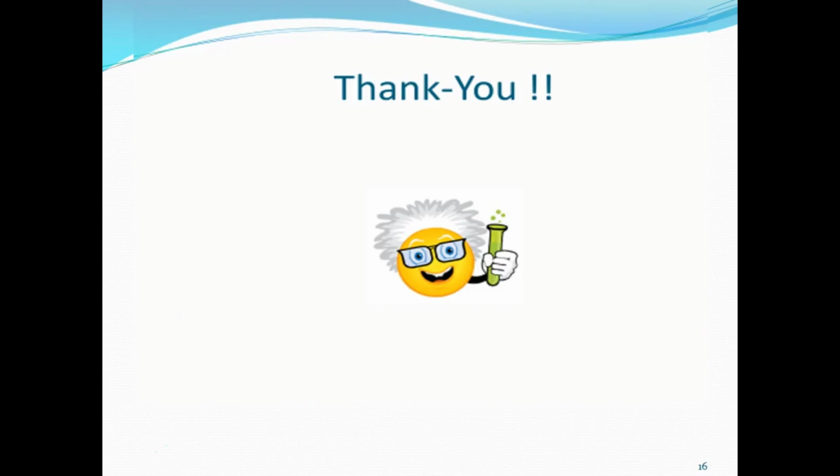And finally, just before I conclude, I just wanted to highlight that it's essential that data generated by any analytical procedure, it's essential that the procedure is fit for its intended purpose at all times during its life cycle. And we must be able to monitor and control the performance of your procedures, normally by investigating out of trend data. We normally implement routine monitoring of these methods. And if necessary, we control changes made to the procedure through change control. That's the end of this lesson. Thank you for listening.